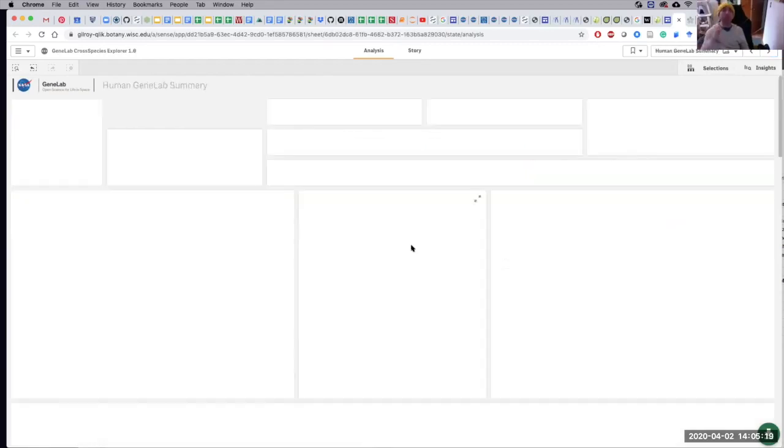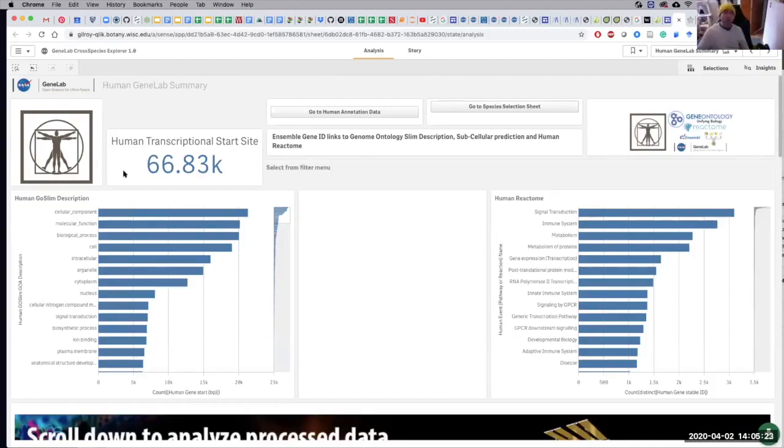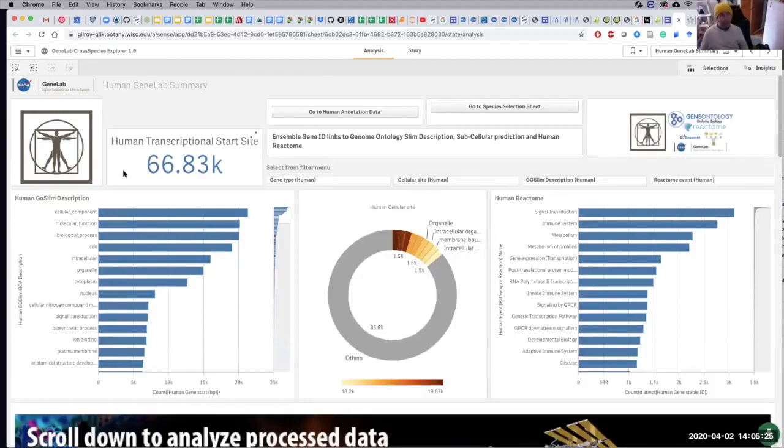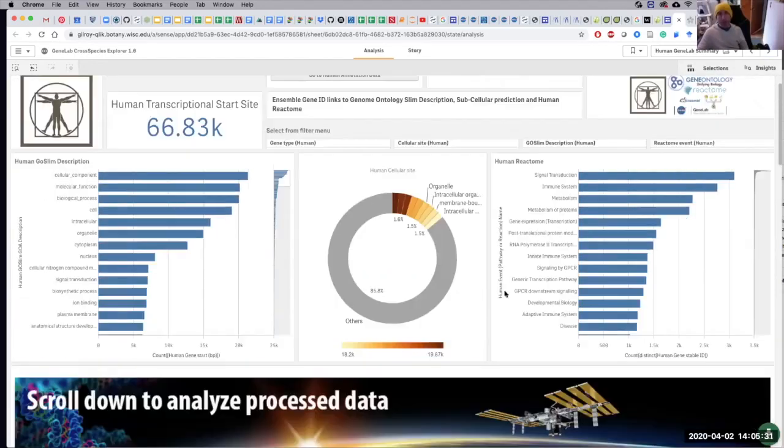Why not? So we've got a lot of potential transcripts in humans. So, okay, 66,000. It's a lot to take in, so I'm going to scroll down.